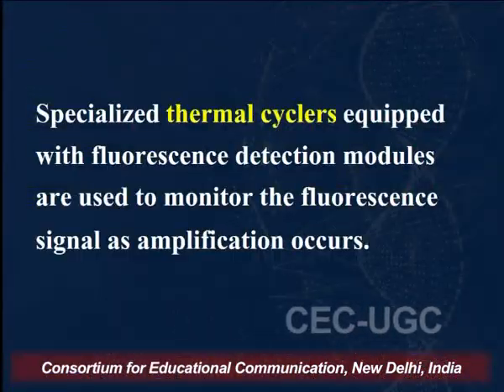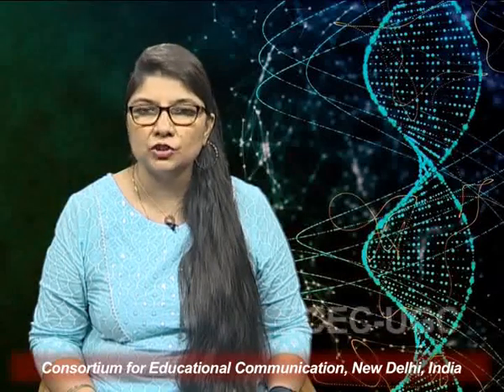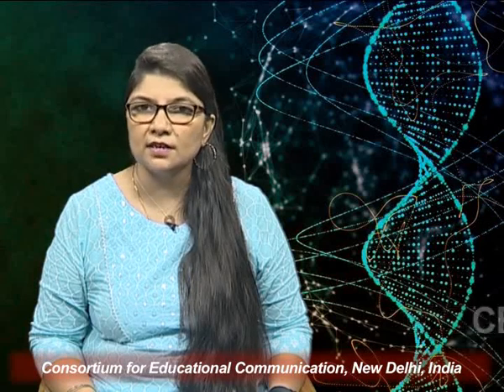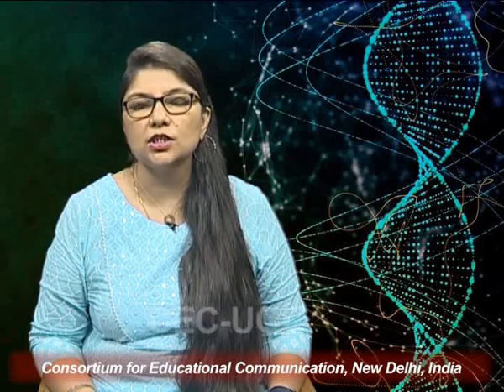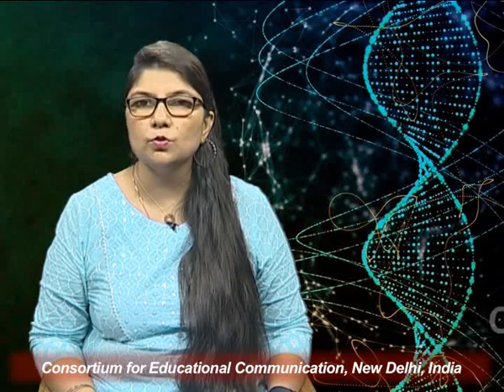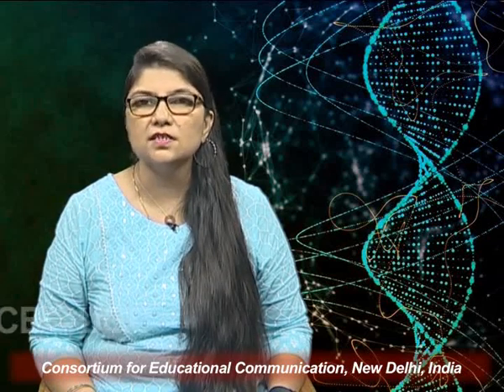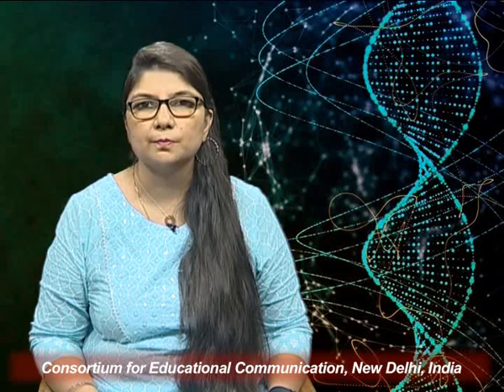The specialized thermal cyclers equipped with fluorescence detection modules are used to monitor the fluorescence signal as amplification occurs. So, apart from the simple PCR machines, specialized thermal cyclers are used for quantitative PCR, in which there is a fluorescence detection system also, because as the amplification occurs and the fluorescence signal is produced, this detection system detects the fluorescence and gives us the result of how much the fluorescence has increased.